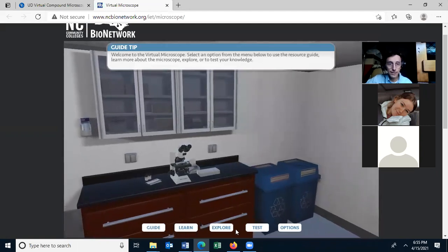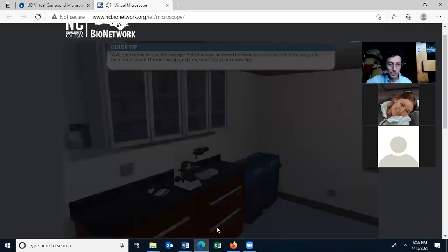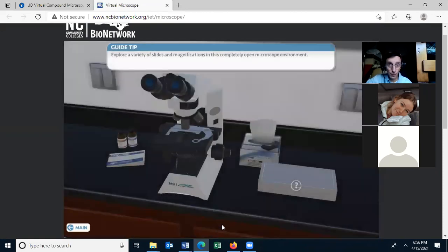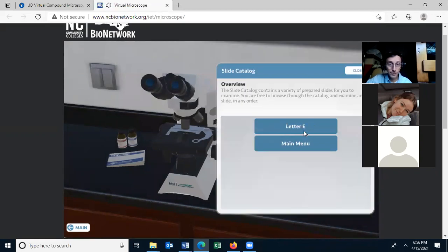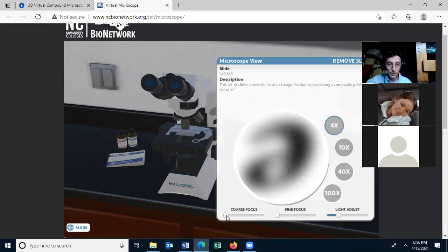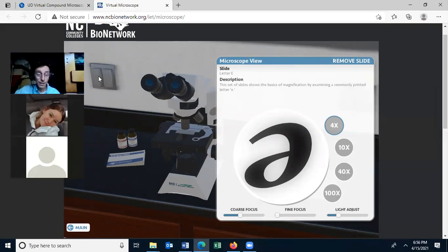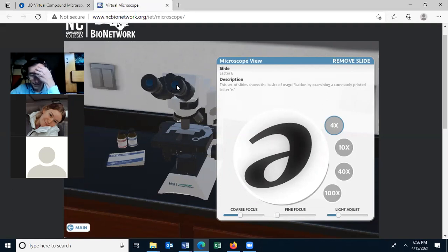In the virtual microscope, click each of the links — you don't have to take the test, but reading helps. The Explore mode lets you virtually work with the microscope: grab a sample slide, such as the letter E, and it will load. It won't be in focus at first — use the coarse focus, then the fine focus, and you can switch objective lenses. For the virtual lab, use the link on the lab manual.